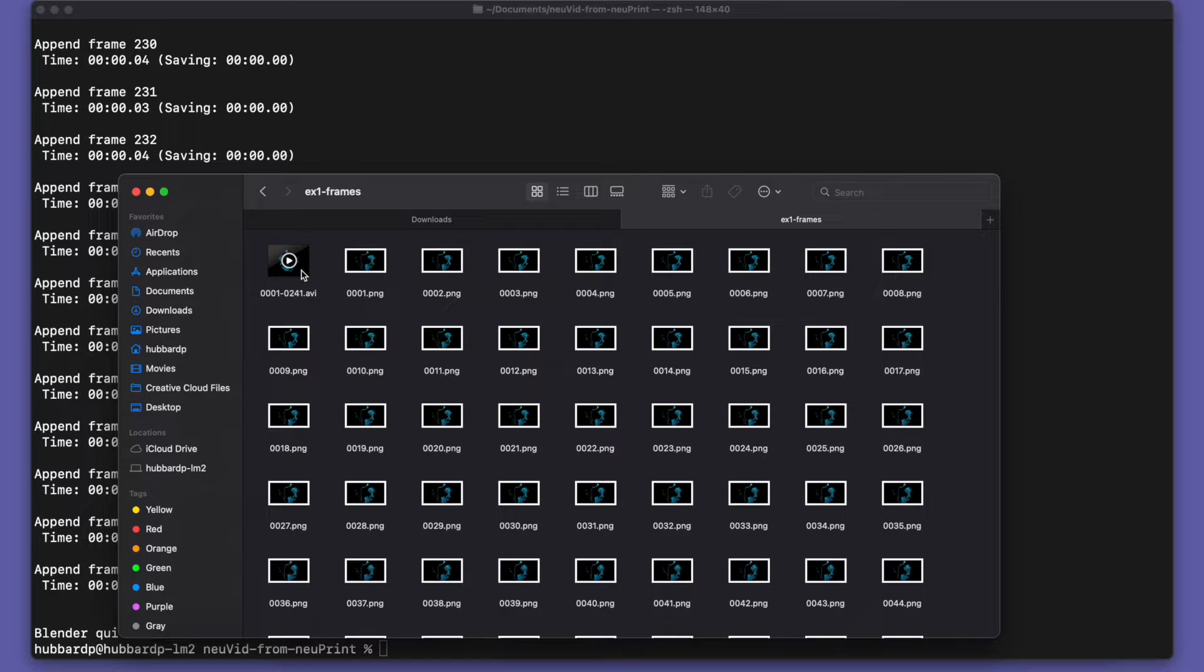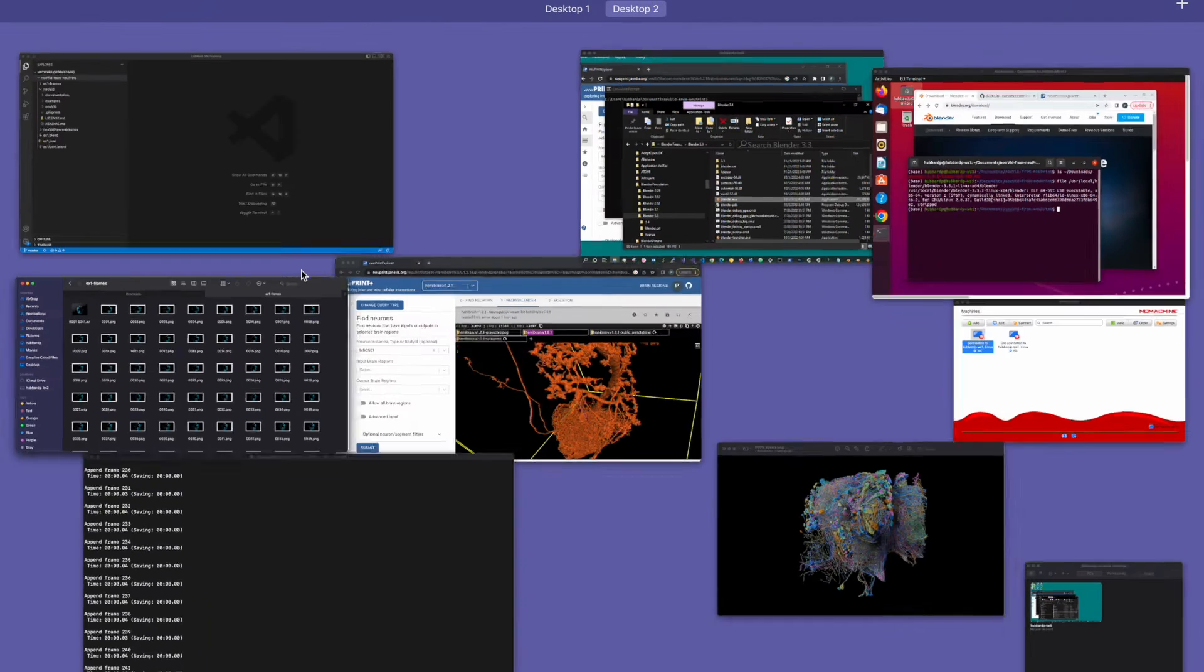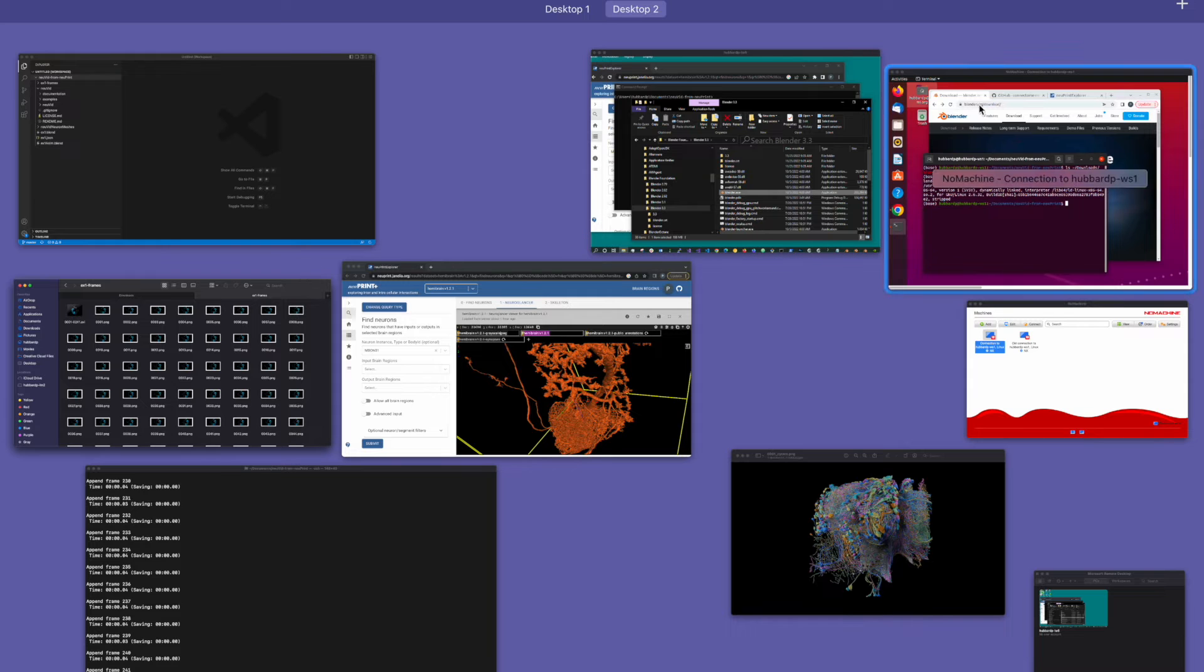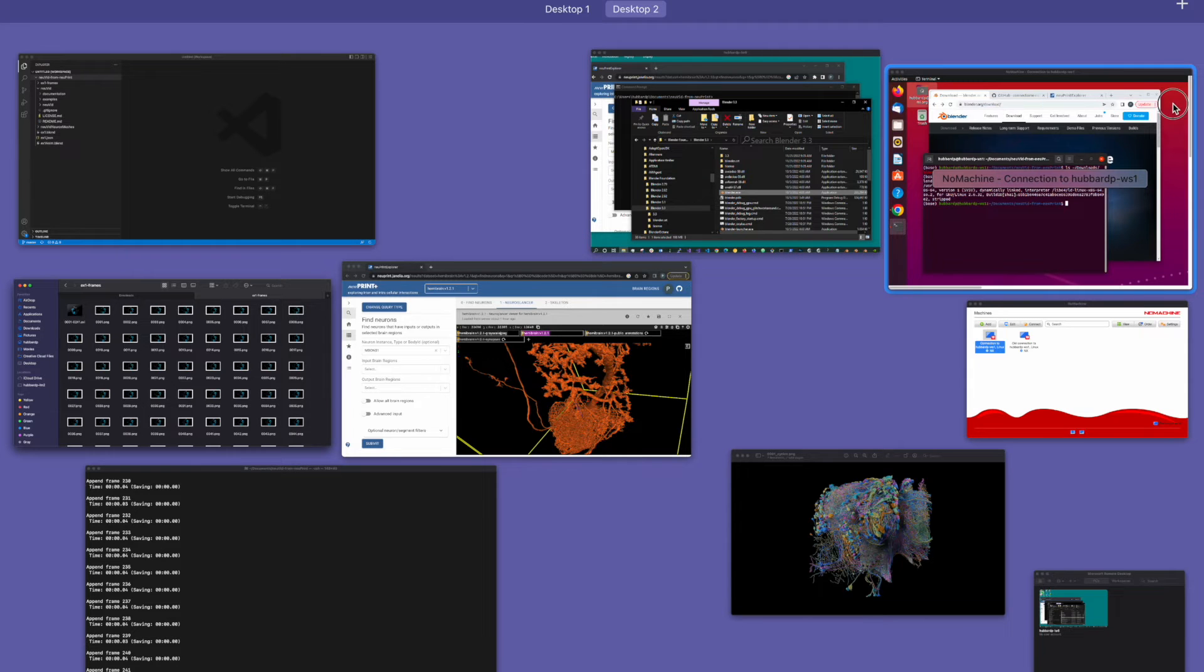It looks pretty good, so we're ready to try something fancier. But first, I want to say a little bit about Linux and Windows.